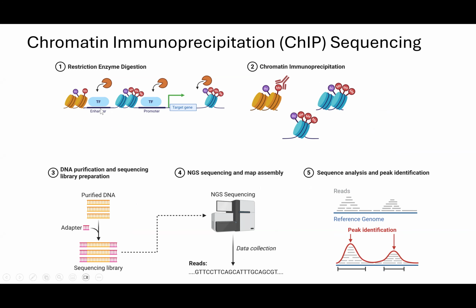This is often done through restriction enzyme digestion, like I show here, but can also be done through something simpler like sonication. Since the DNA is going to be bound to proteins, here I'm showing histones, but this could also be a transcription factor or a chromatin remodeler or anything like that, you have the DNA, but you're also going to have in those small pieces the attached proteins.